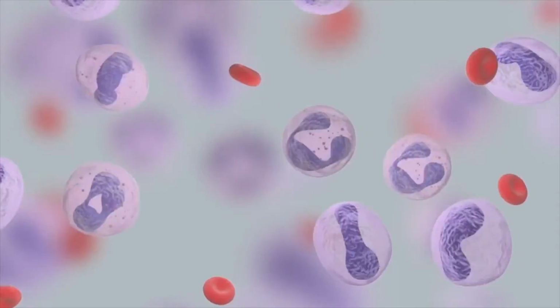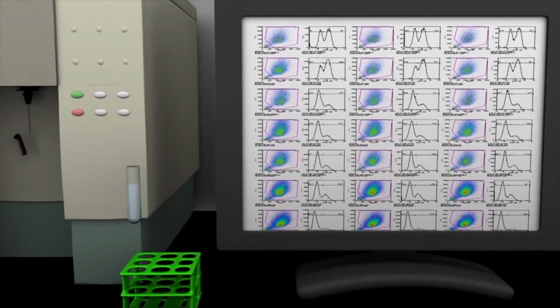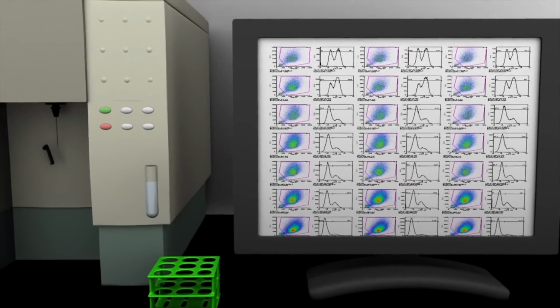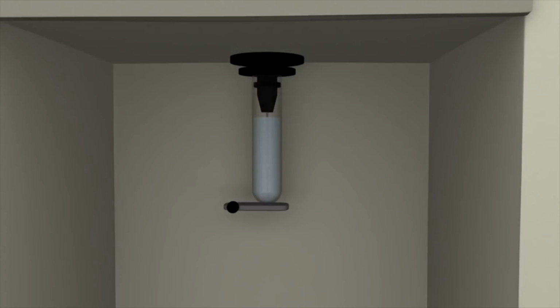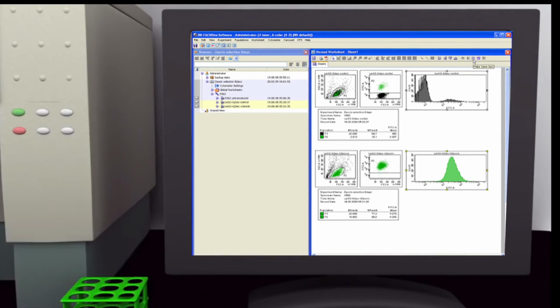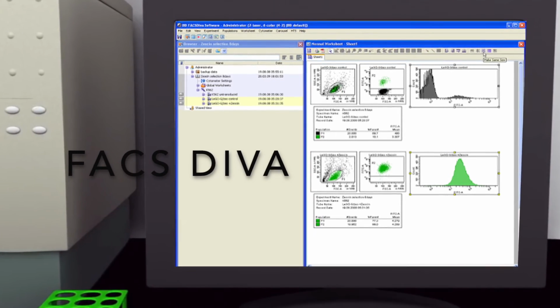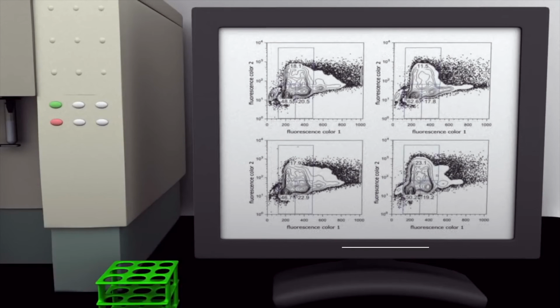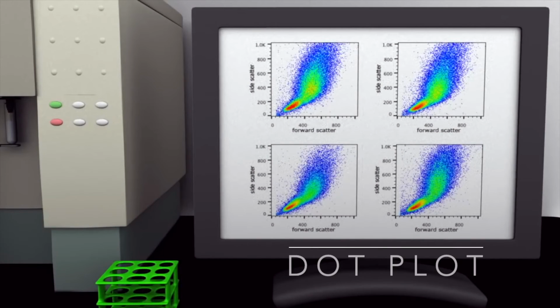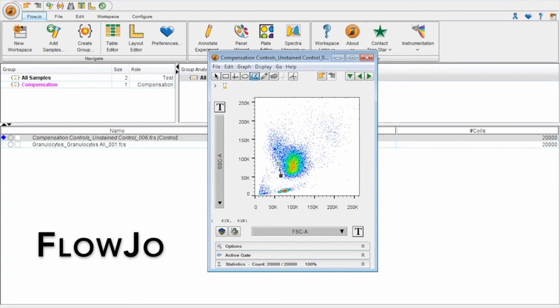Here we have a case where we want to identify neutrophils through the expression of CD16B and CD15. The first step consists of the staining of isolated granulocytes using fluorescently labeled antibodies. Then the sample has to be placed in the sample inlet of the flow cytometer, and now the equipment will start to uptake the sample. Next to the flow cytometer, there is a computer that is receiving the electronic signals that we can visualize by using software such as FACSDiva. The data can be plotted using histograms, contours, and dot plots. The deeper data analysis has to be performed using other software such as FlowJo.